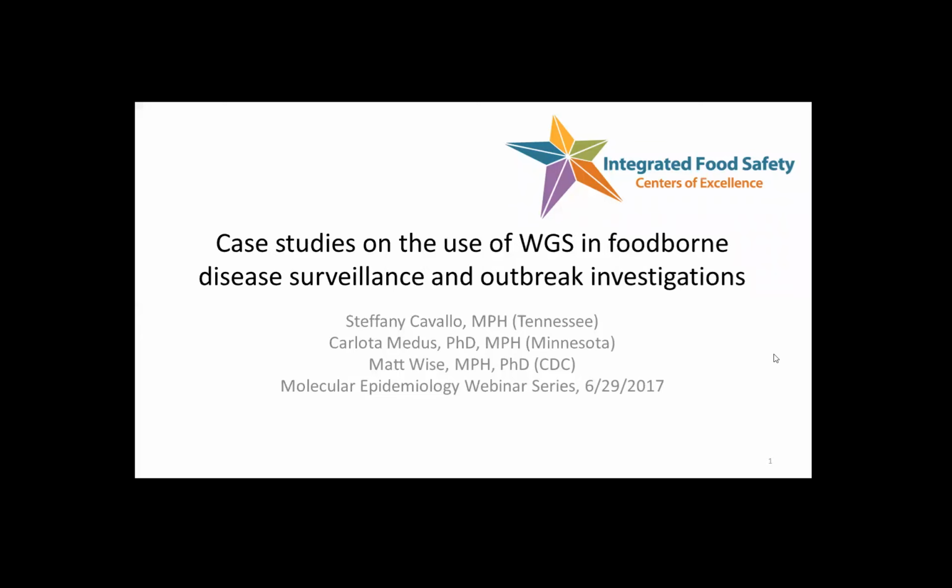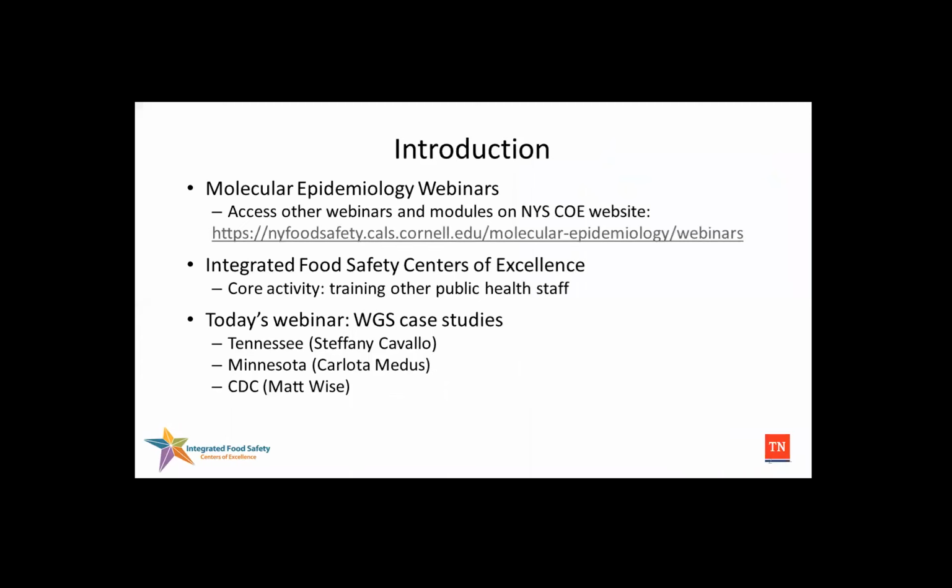So today we're going to be covering case studies on the use of whole genome sequencing in foodborne disease surveillance and outbreak investigations. And like I said before, this is the fourth and final installment of the webinar series.